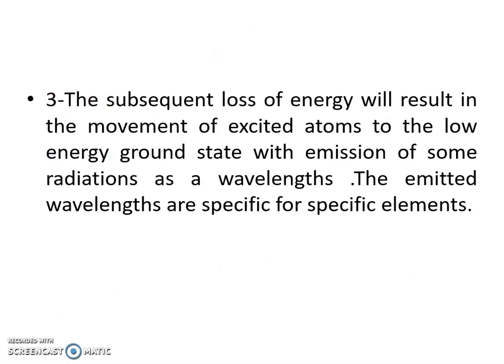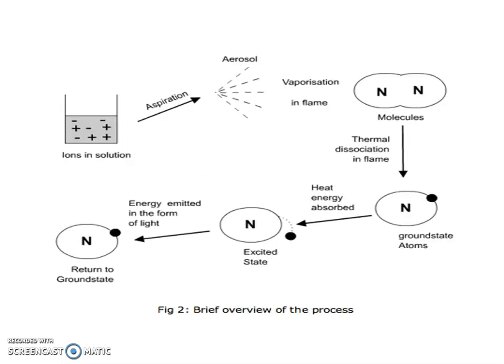The subsequent loss of energy will result in the movement of excited atoms to the low energy ground state with emission of some radiation as a wavelength. The emitted wavelengths are specific for specific elements. Look at this pictorial picture: a brief overview of the process.